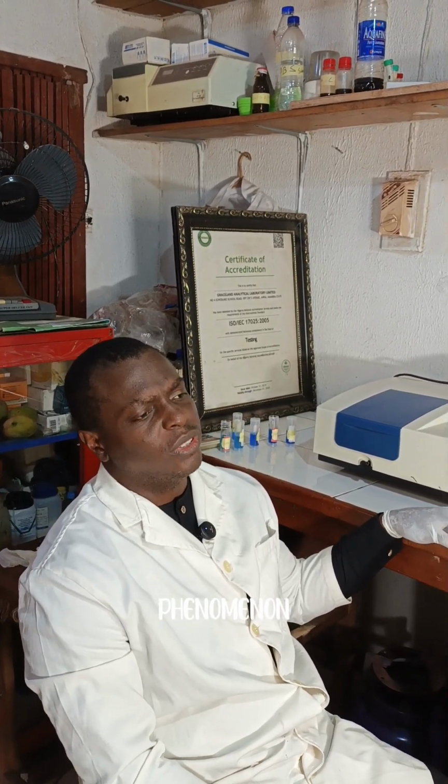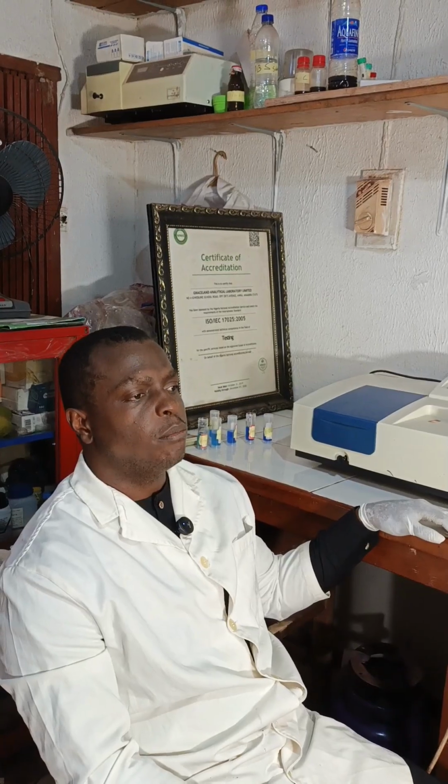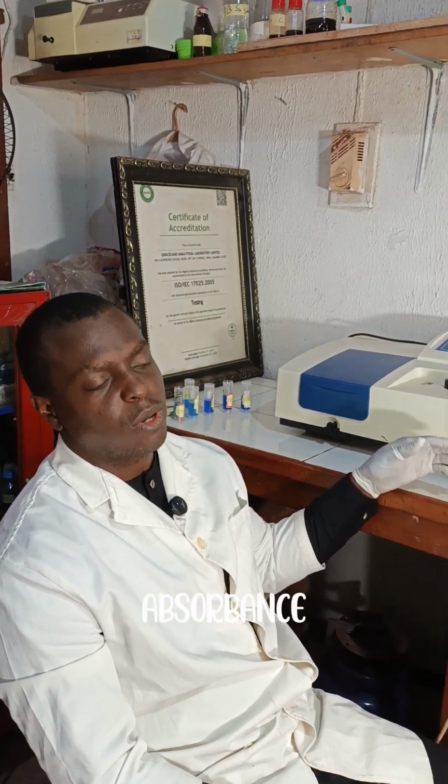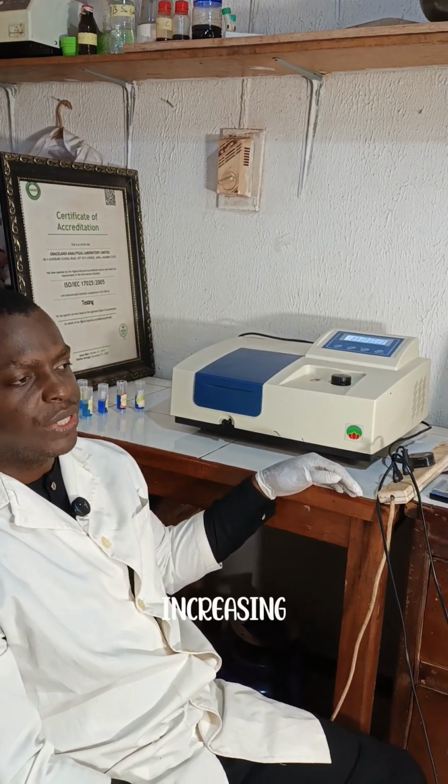This particular phenomenon relies on the Beer-Lambert law that states that absorbance is proportional to concentration. Mathematically, absorbance A is equal to εbc, where ε is the molar absorptivity, b is the path length, and c is the concentration. And since absorbance is directly proportional to the concentration, as absorbance is increasing, concentration as well will be increasing.